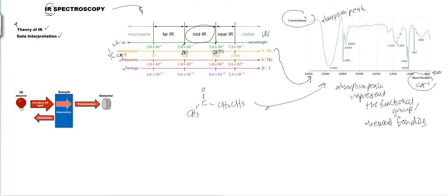So for example, you have a very complicated molecule. There are many bonding, banyak functional group involved. So you are expecting many peaks in the IR. But when we talk about the IR spectroscopy ni, it is a very unique spectroscopy because each of the bonding, for example, each of the functional group, for example, you have carbonyl, you have hydroxyl ke, you have a C double bond C ke, so it has its own peaks pada frekuensi tertentu.